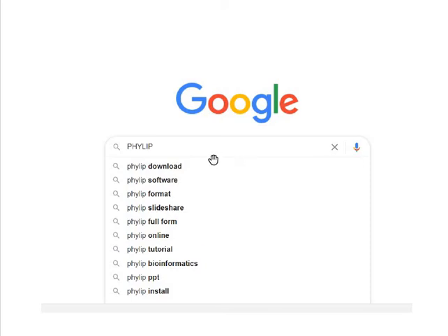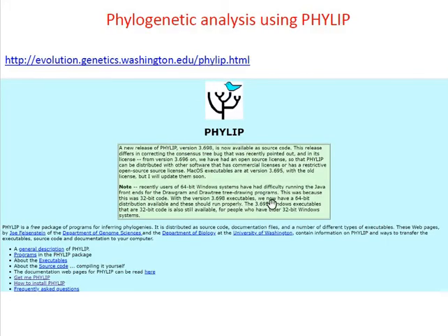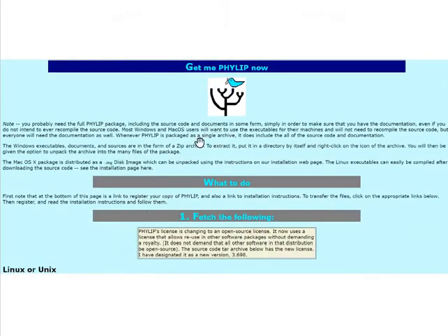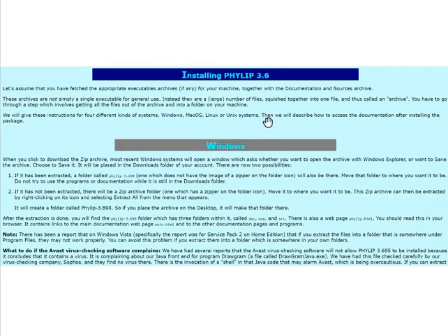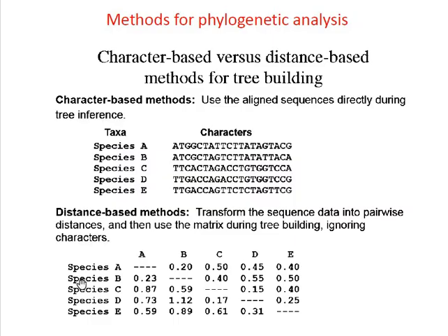A bit about how to download this software: just go to Google and type in PHYLIP, it will lead you to this web page. Then scroll down and go to 'Get me PHYLIP software.' For Windows, they have given two different programs, so I suggest you download version 3.695 for Windows. You'll then have instructions on how to install the program on Windows.